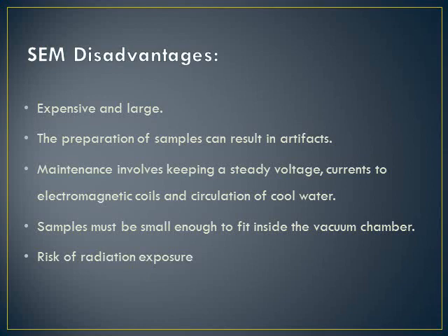The sample chamber is designed to prevent any electrical and magnetic interference, which should eliminate the chance of radiation escaping the chamber. Even though the risk is minimal, SEM operators and researchers are advised to observe safety precautions.